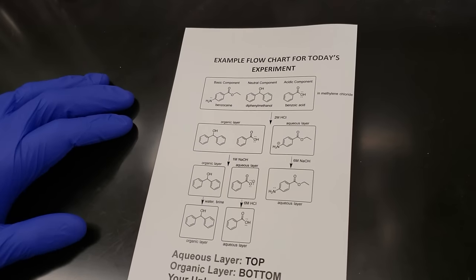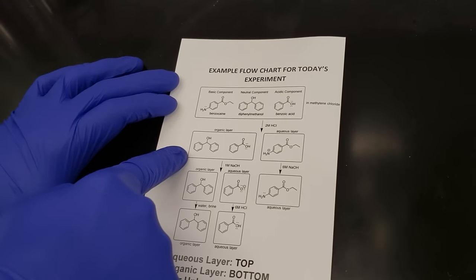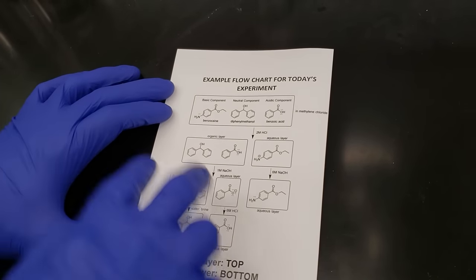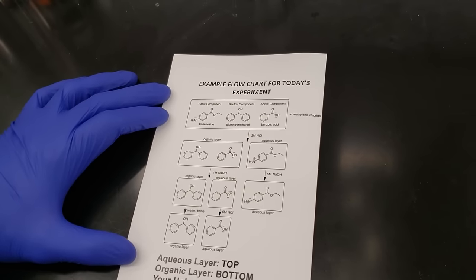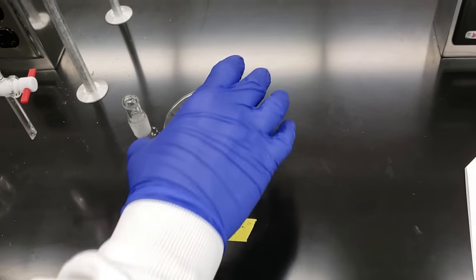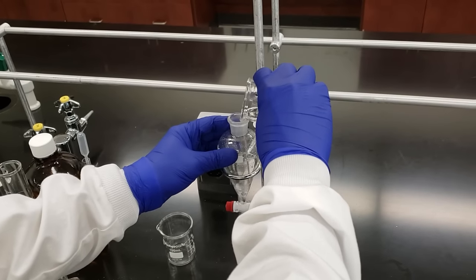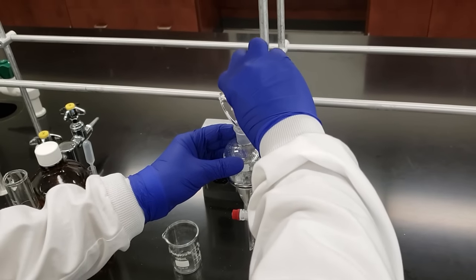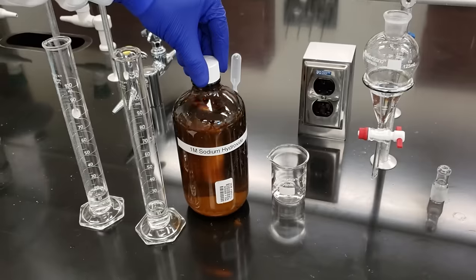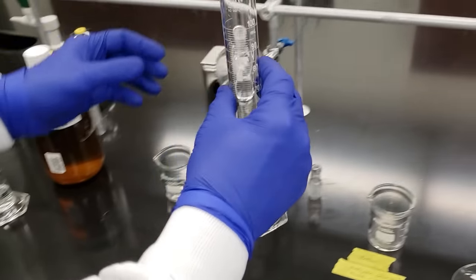We've isolated our benzocaine successfully and noted the weight on our data sheet. Now we're moving on to the next phase: taking our methylene chloride organic layer, which contains our neutral component and our benzoic acid derivative, and pouring it back into our sep funnel. We'll use 1 molar sodium hydroxide to isolate the two remaining compounds from each other. Make sure our stopcock is closed, then pour the methylene chloride back in. We've measured out 10 mL of 1 molar sodium hydroxide for our first extraction.